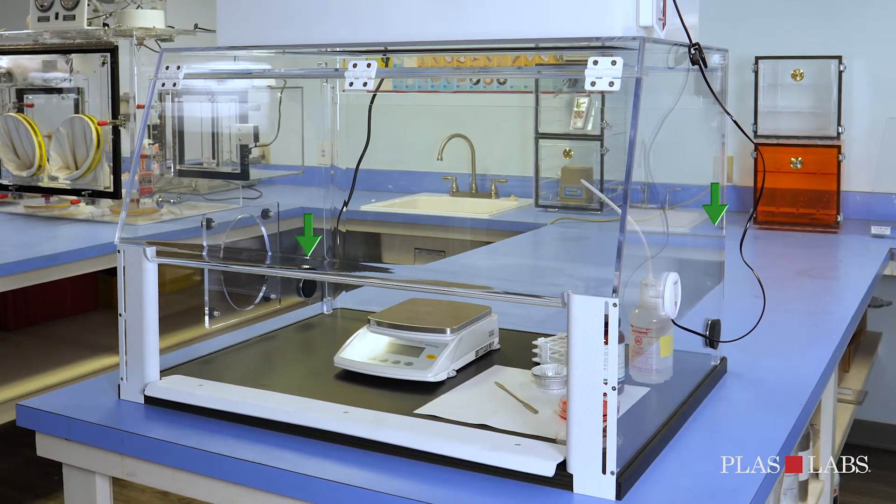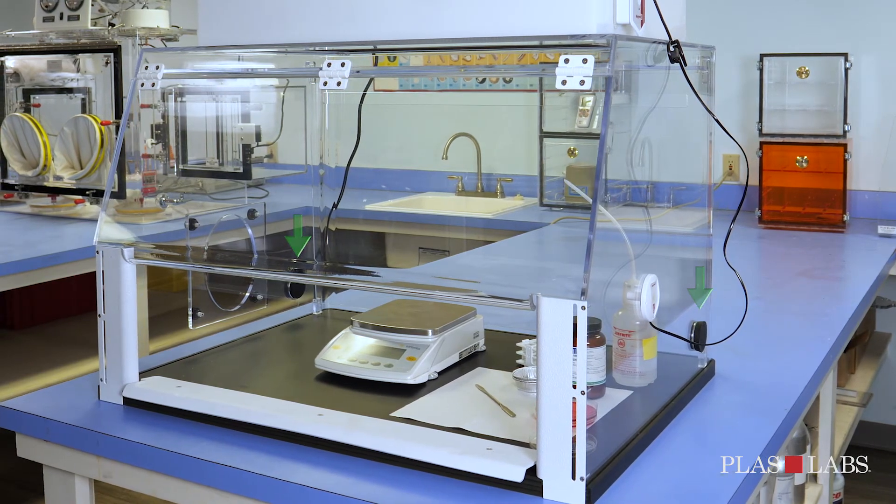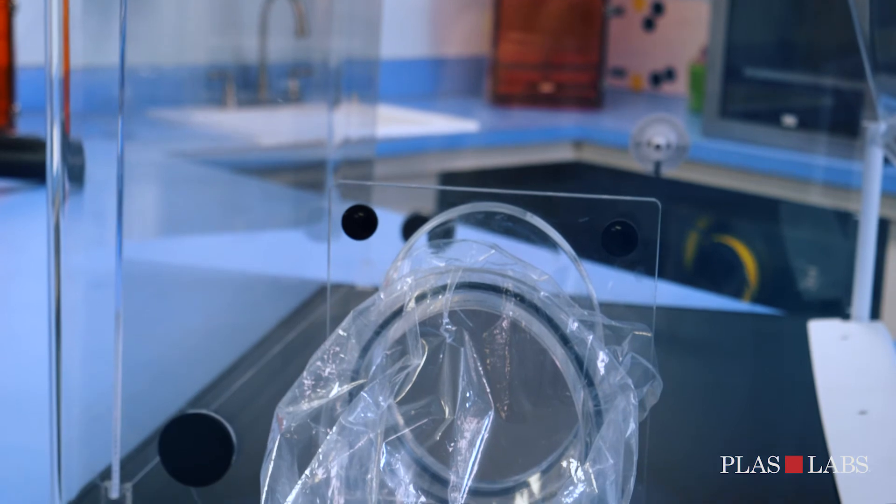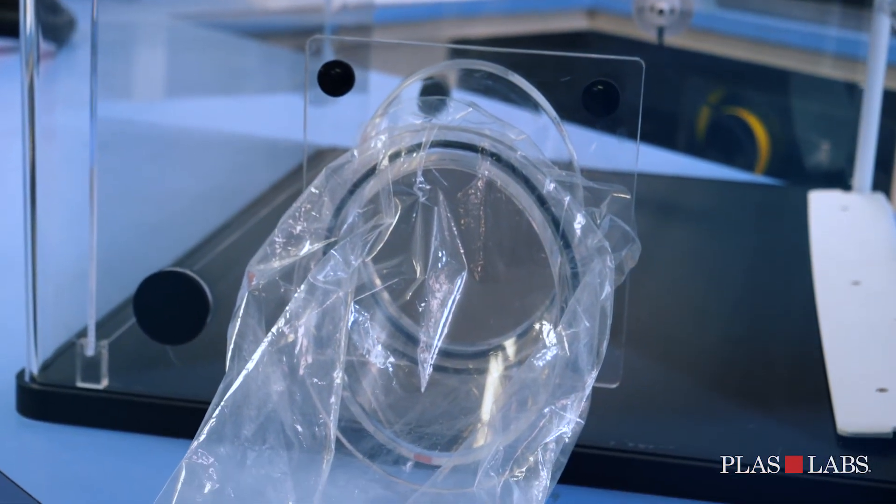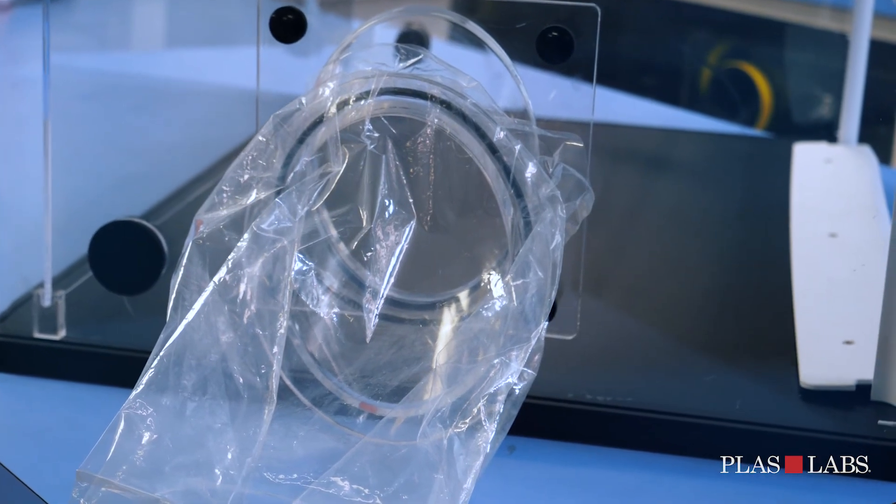Electrical cord outlet ports provide a safe and secure method to let the cable or cord through the wall of the ventilation hood. Each containment hood includes a side blanking plate for the optional purchase of the 900 VBE Bag In Bag Out Port. Contact PlasLabs for additional Bag In Bag Out Port accessories.